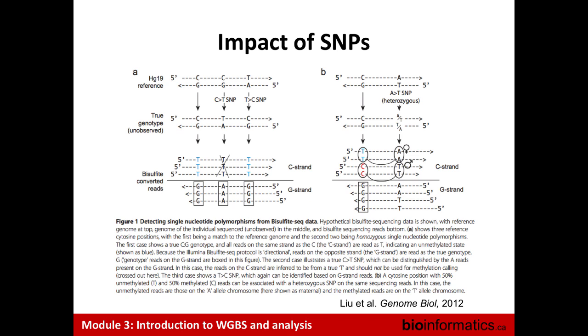Well, usually this is done on an individual by individual basis. Actually, it would, if you were to pool all that data to call the variants, which would probably be a good idea because this way you would have sufficient coverage to be able to call it well. I guess it would also depend on how distinct that population is. Yeah, it depends on how much it's drifted. I think perhaps personalizing the reference for that population, so maybe sampling one or two individuals, and then incorporating those positions in the reference and then realigning, you might see. Again, it depends on how drifted it is. This is a Greenland population? Yeah, Greenland. So it's like a Scandinavian population, or Inuit.